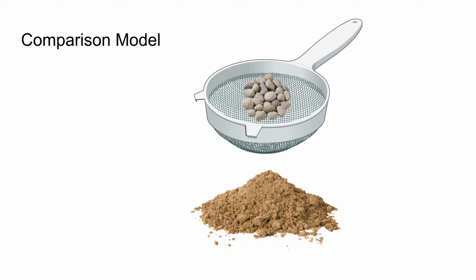And here you can apply this picture to both MS and GC. So for GC, after you shake the strainer, the larger pebbles will stay in the strainer, and then the lighter ones will get strained out based on how small they are. So the smaller ones will fall out sooner, so they have a smaller retention time, and then the larger ones will have a longer retention time.